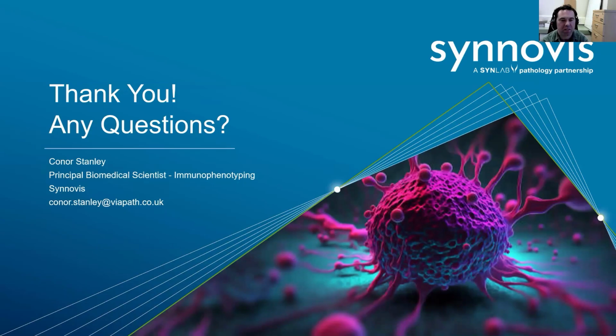Some of the real difficulty in flow cytometry is designing and working up your panel from scratch, whereas with these tubes it's all done for you beforehand. You set up your analyzer, which is the difficult part, but then you can just buy in these tubes and run them. But I don't know, the expense could be prohibitive.